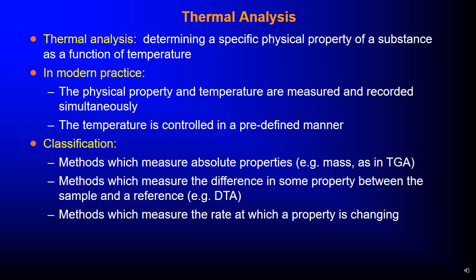So, just some classification of methods. Methods which measure absolute properties, for example mass, are handled with TGA, thermogravimetric analysis.